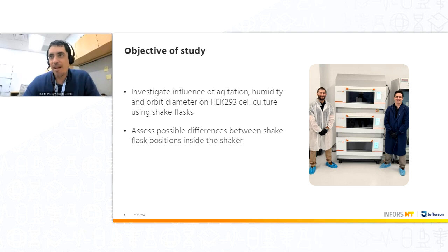Because the timing and efficiency of the transfection process in a HEK293 cell culture for viral vector production really depends on these variables. Usually, to have a high transfection efficiency, you've got to have a lot of cells, and you also need those cells to be really active. And that means you have to know which condition gives the highest specific growth rate.